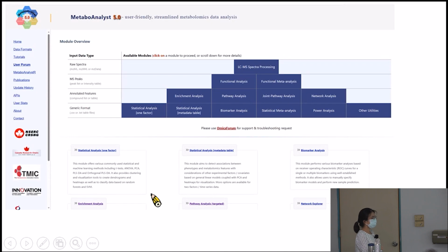I'm not sure about the platform, but in my experience, I have used this platform. What I did was use around 10 million cells for metabolite extraction, and this sample had its own control group. So I can get some information from this data set. But how to quantify these metabolites, I have no idea. Yes.